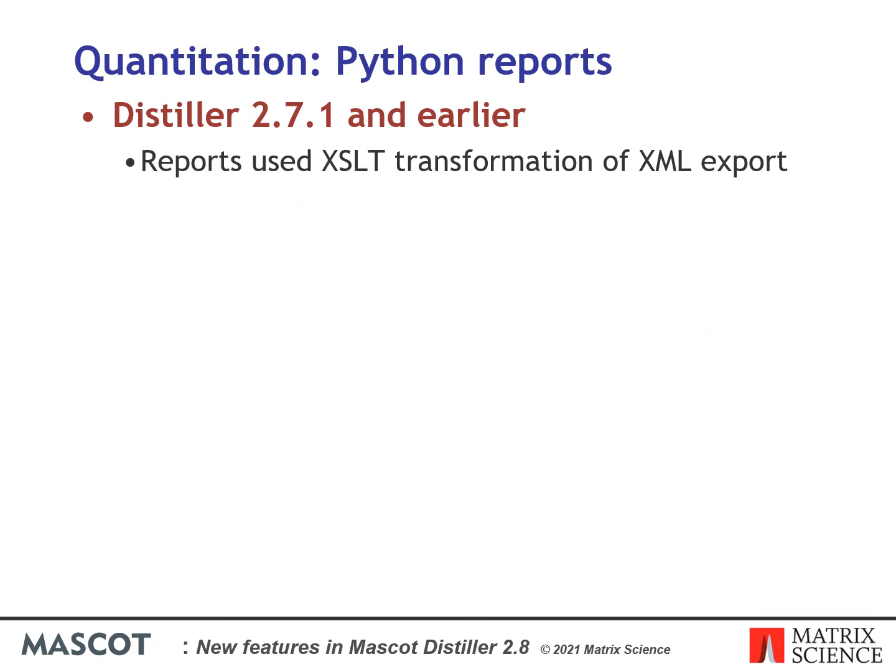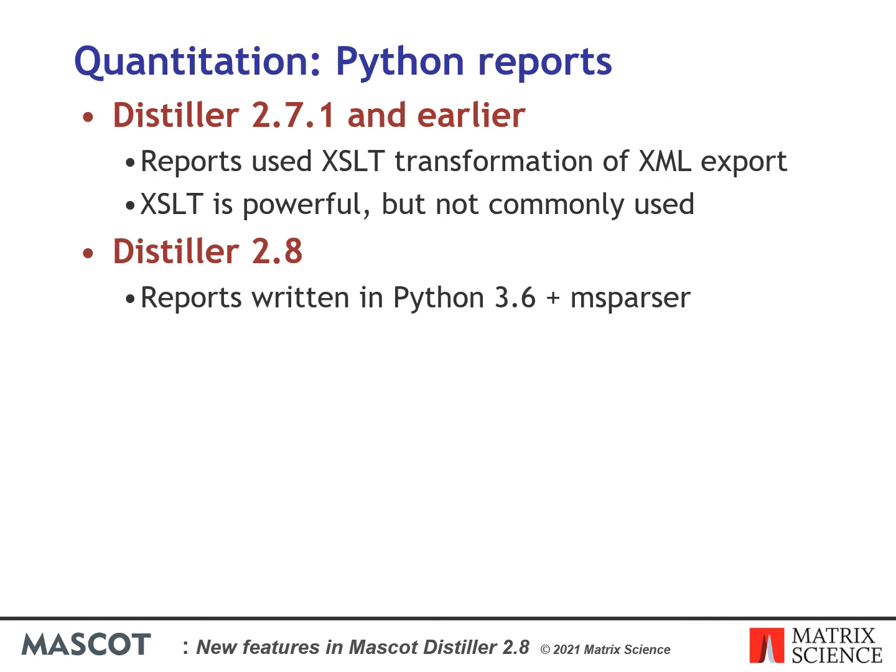In Mascot Distiller 2.7 and earlier, reporting of quantitation results was handled using XSLT transformation of the XML export of the quantitation results. XSLT is a powerful language but it's not commonly used, and you'd probably struggle to find someone in the lab familiar enough with it to write custom reports. In Mascot Distiller 2.8, reports are written in Python 3.6 and use msparser to access the search and quantitation results, providing simple access to those results.